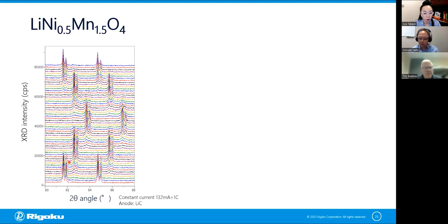So in this charging and discharging cycle, we started from charging. While we charge this battery, originally the peak was here, moved to the second peak here, and then finally moved to the last peak here. So we found 3 distinctive peak positions while this battery was charged.